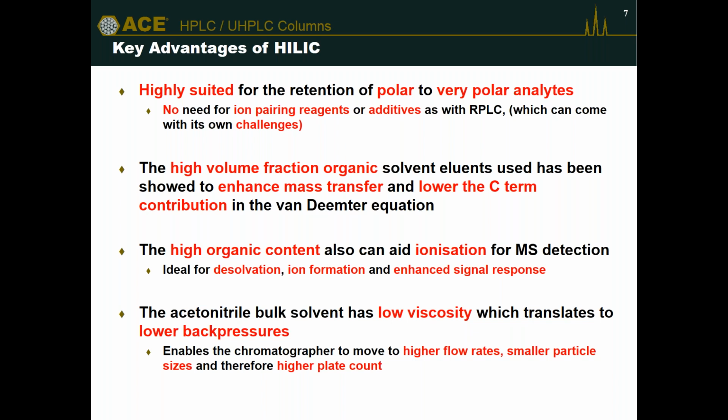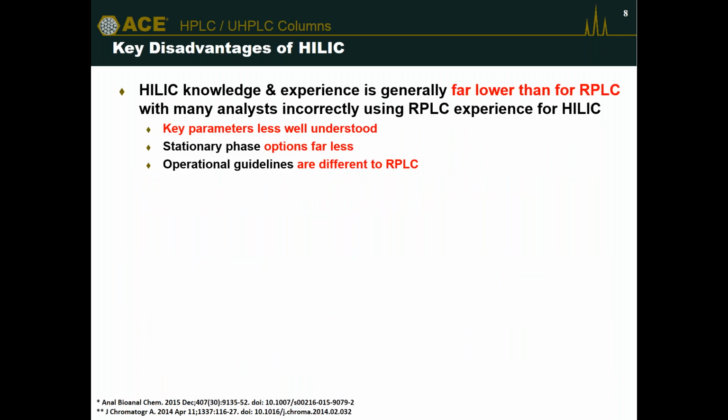However, it's just as important when we consider the good things that we also think about the disadvantages of HILIC. This is particularly where some of the challenges have come from people trying HILIC for the first time or having bad experiences with HILIC. And the main issue that I've found in talking to many people all around the world is down to the knowledge and experience of HILIC as a technique.